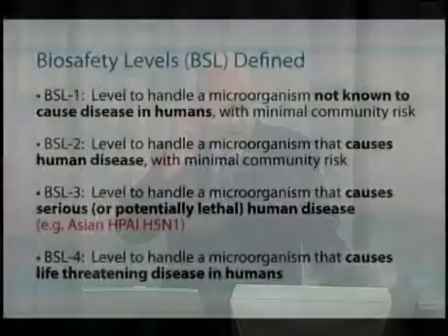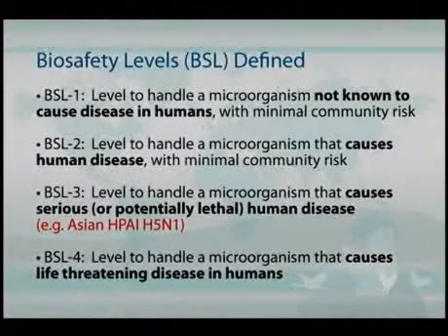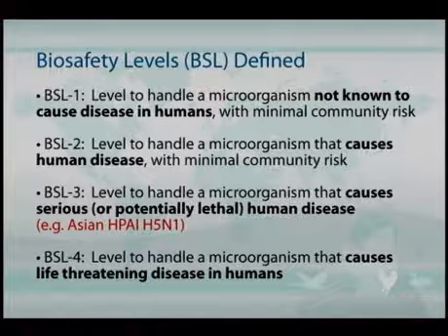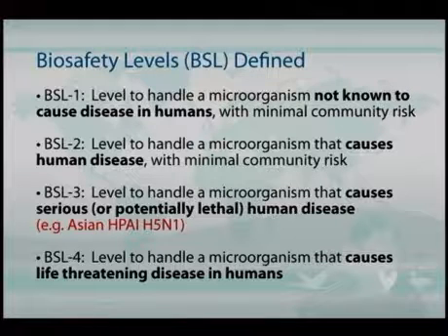And I would encourage you to make sure that you understand what those enhanced features are that would be required to work with the Asian high-path H5N1 in terms of isolating the virus. Usually, if the laboratory is doing just PCR only, without doing egg inoculation, then BSL-2 laboratory environments are usually acceptable.